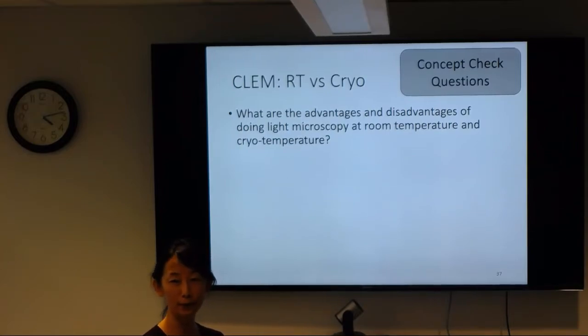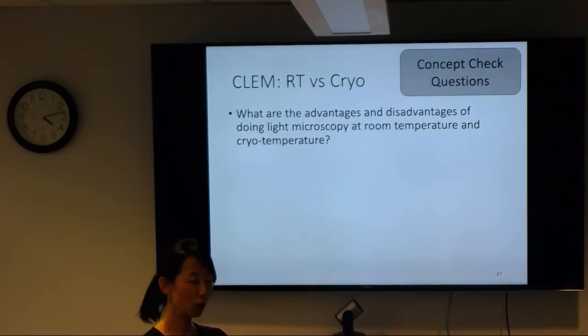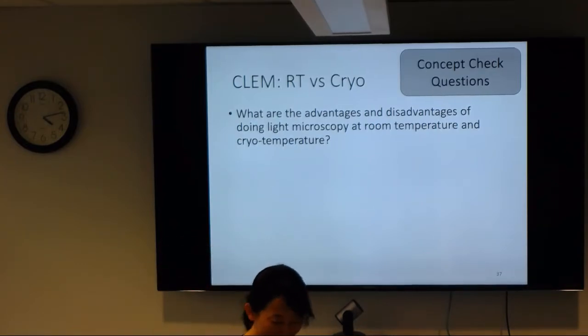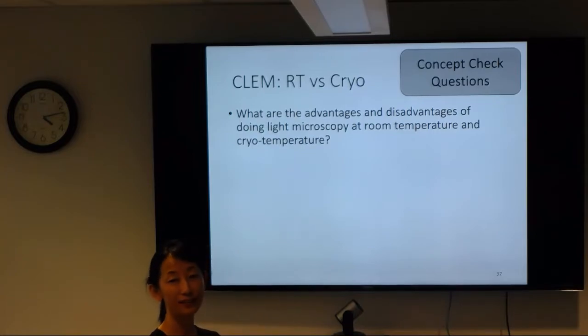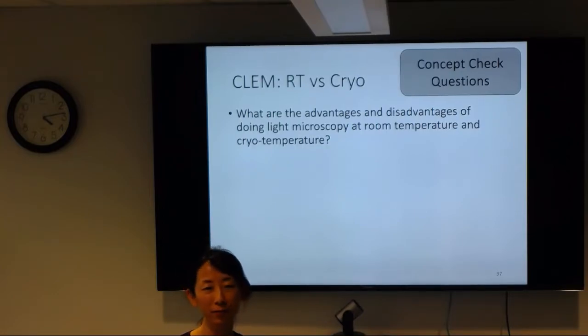Advantages, room temperature. Nobody saying anything. So I already mentioned... well, I'm assuming room temperature doesn't require a special setup that requires nitrogen flow and compensation for heat transfers. Slightly easier. Right, that's true. And I also mentioned some of the fluorophore performance at room temperature is actually a lot better than at cryo temperature. And then the setup will be easier.